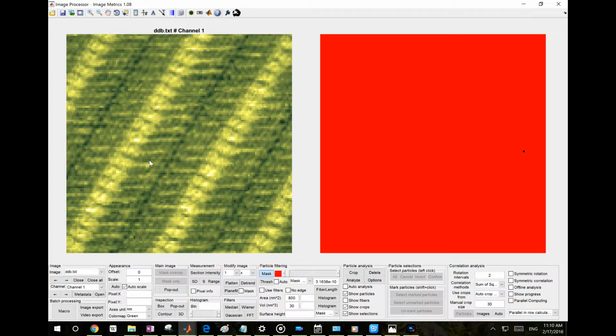Apparently there's some kind of noise, and I would like to get an average result of these and improve the signal to noise, which should improve the resolution significantly. So all you need to do is click the image again, and this is one example. Maybe I should use some better examples, but this is a fine example.